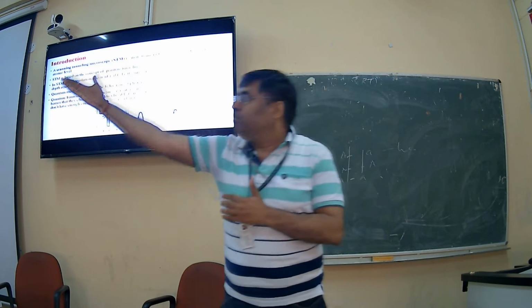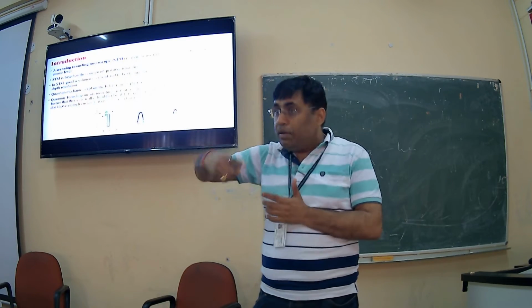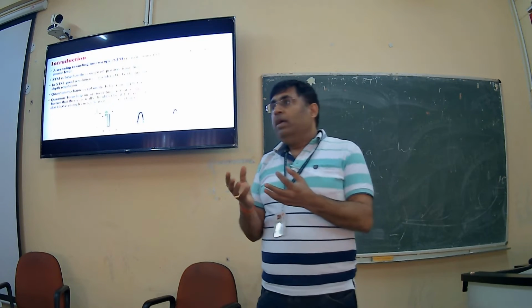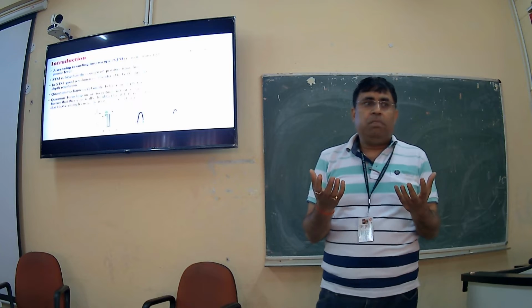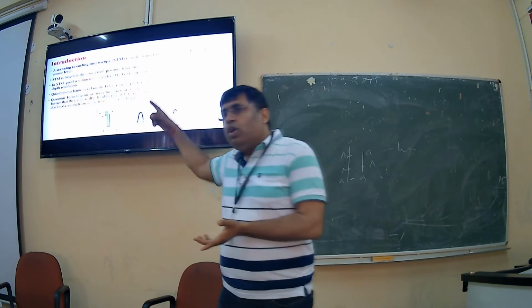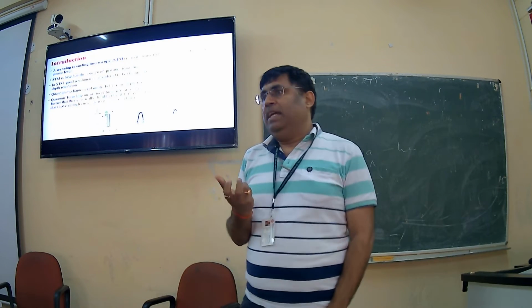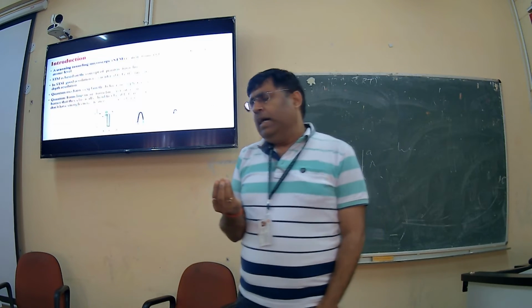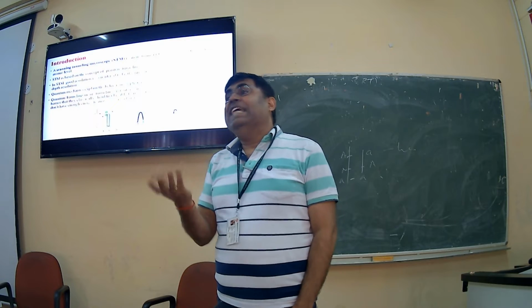it can cross the barrier using the wave phenomenon. So what is the conclusion for this one? It means lesser energy is required to cross this barrier. This we call the tunneling phenomenon, where the electron passes through the tunnel by using a less amount of energy.